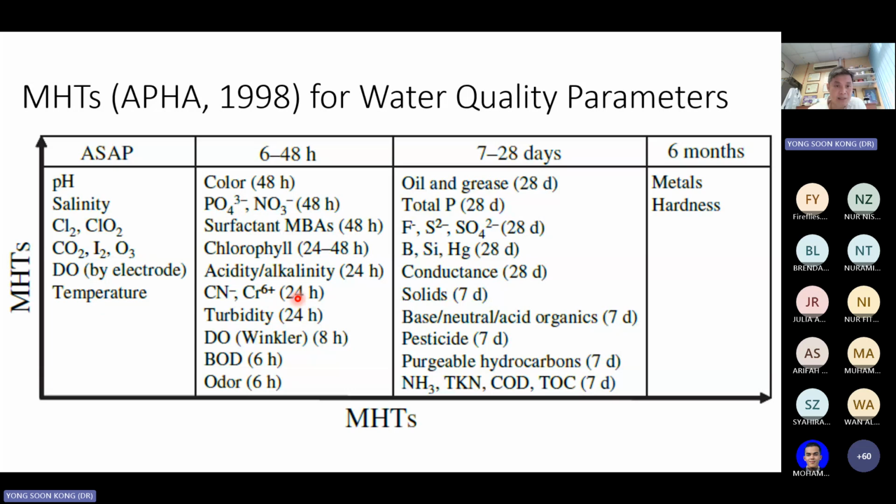So that goes to the next one, whatever the analytes. Now these analytes, there are some too unstable. Either they're too unstable or they are the nutrient that is constantly being uptaken by the bacteria and also the microbes inside the water. So they also change relatively quick, but maybe you can buy some time because as long as you chill it, the microbe stays inactive. So you have extra time.